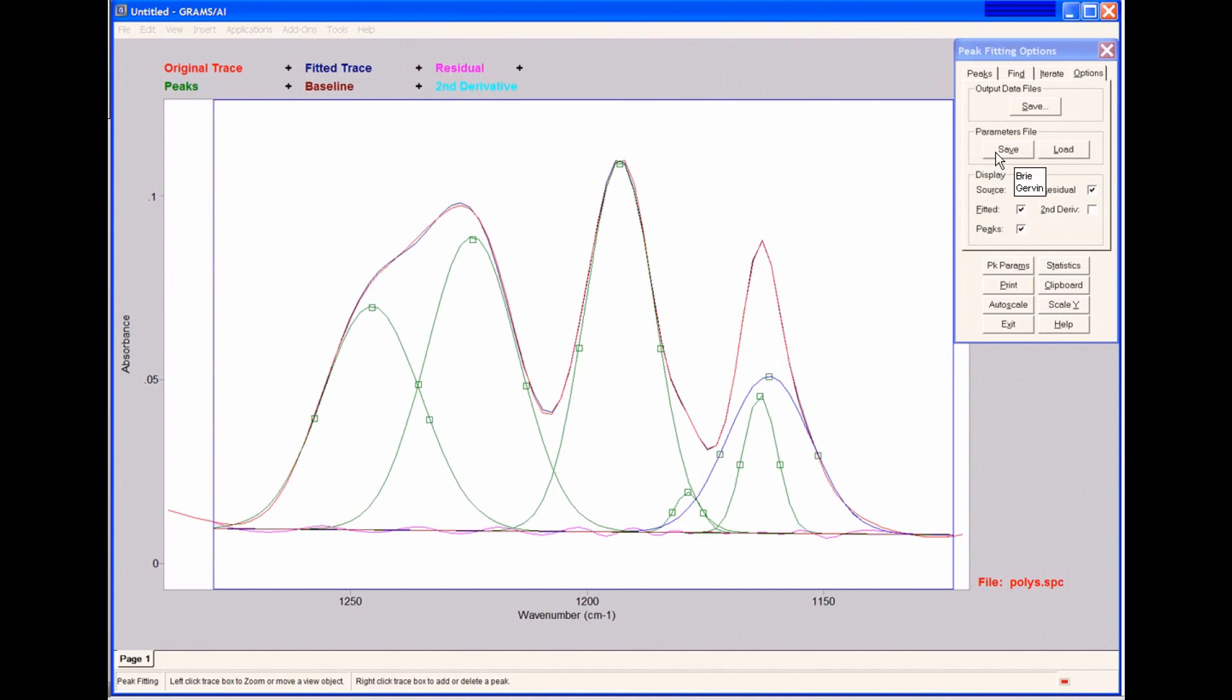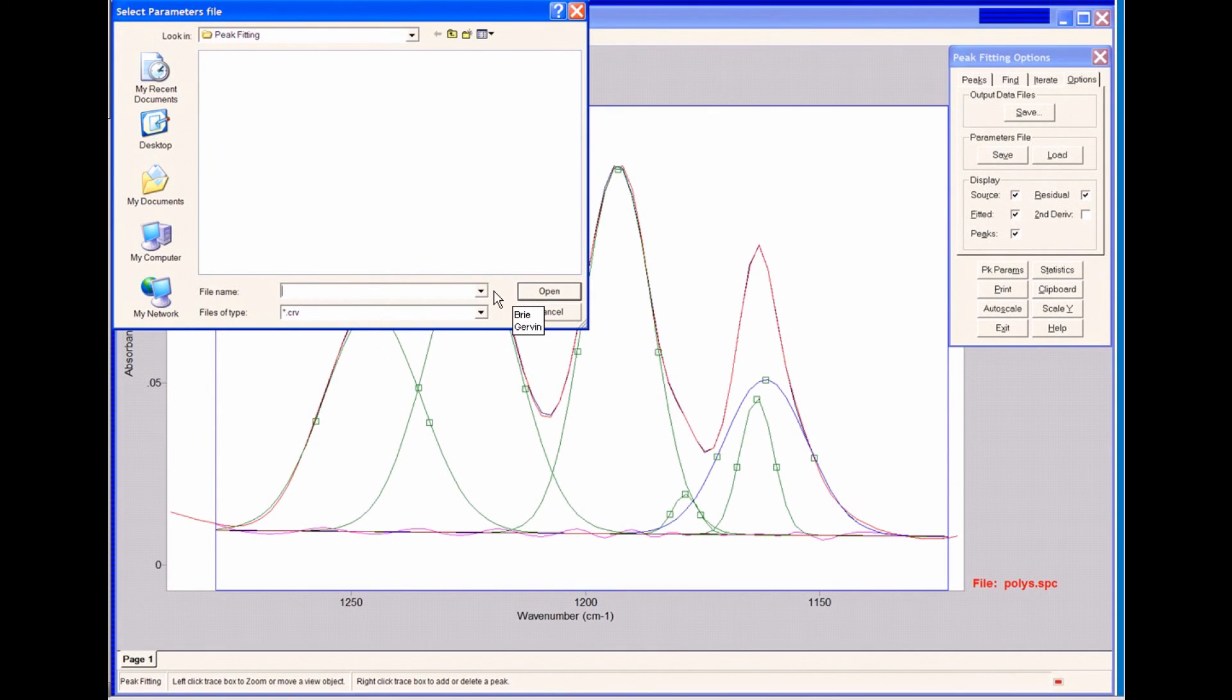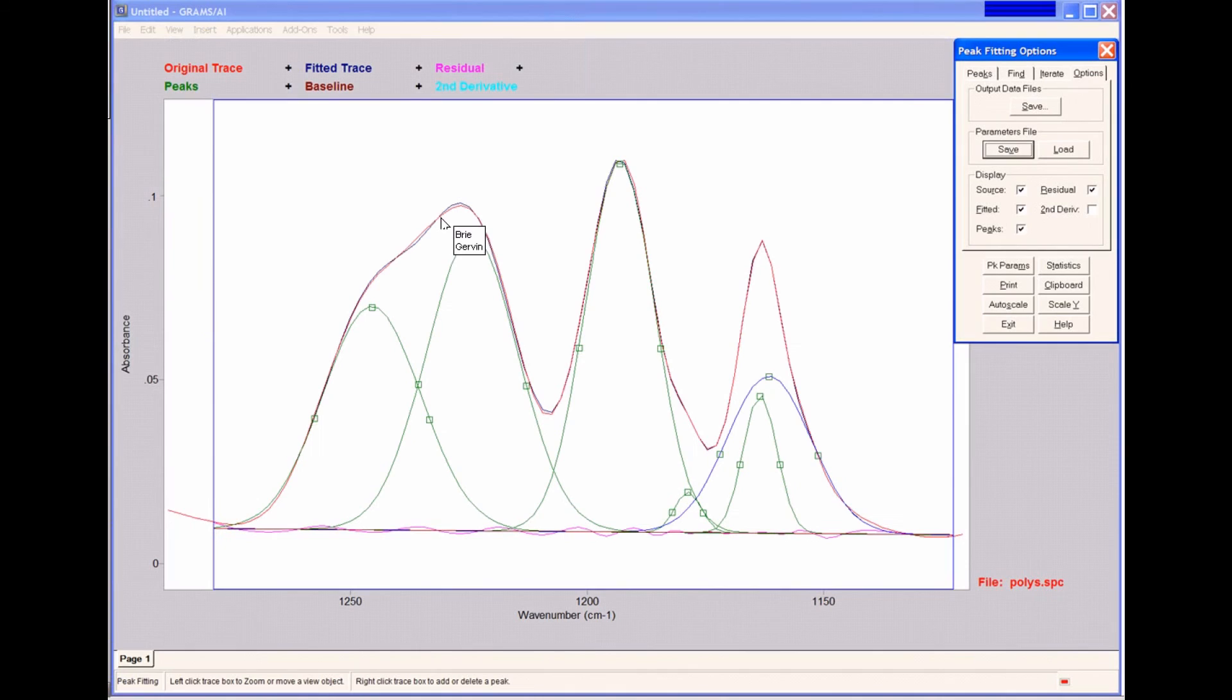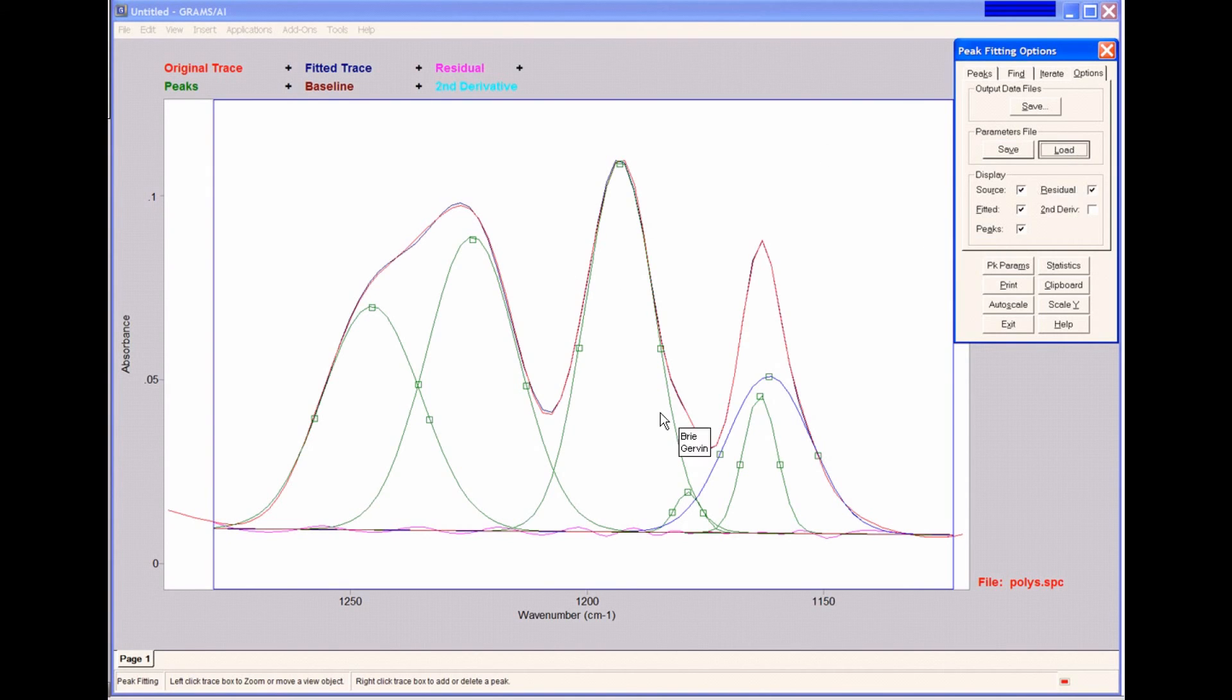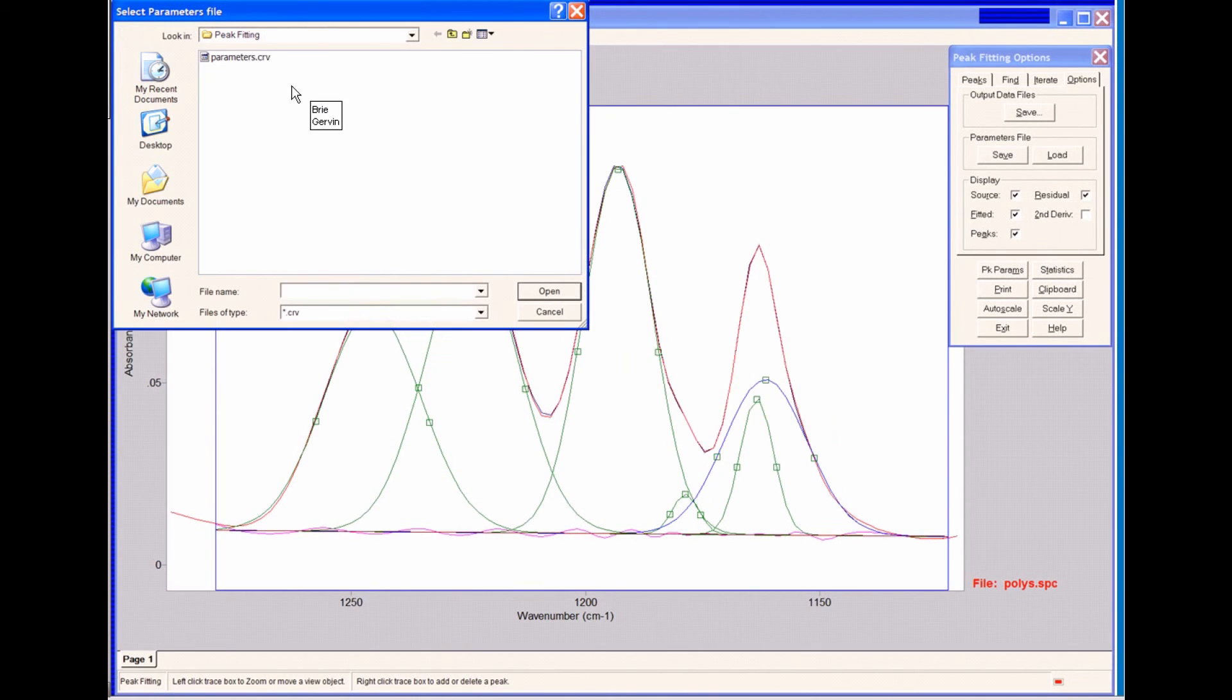I can simply click Save, and it will save the parameters file based on the fit that I just performed. And I can reload that file later on using Load to load the data I just saved.